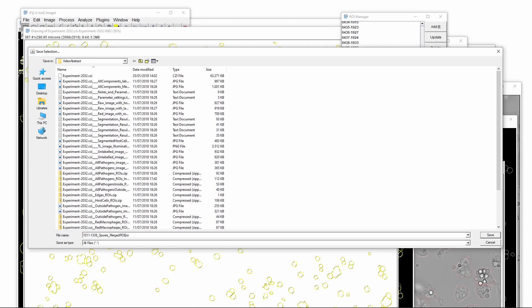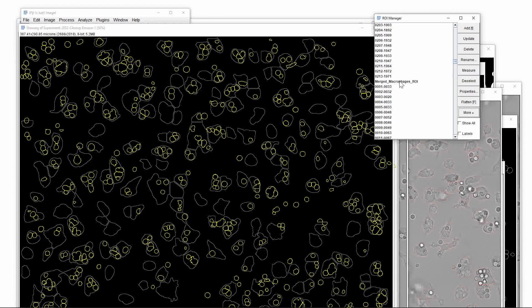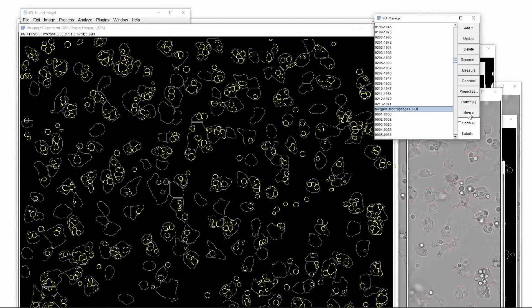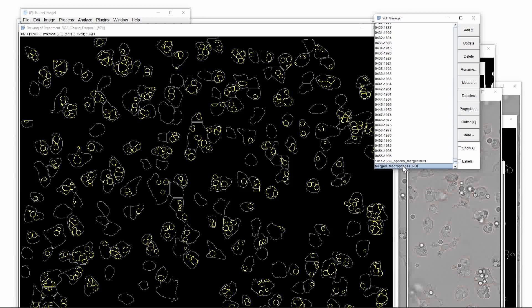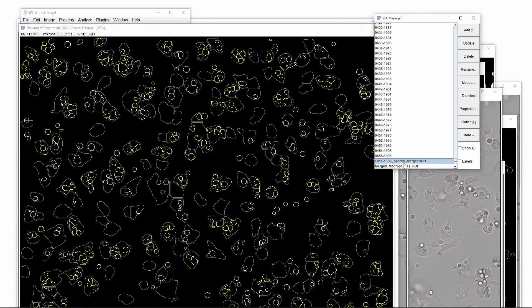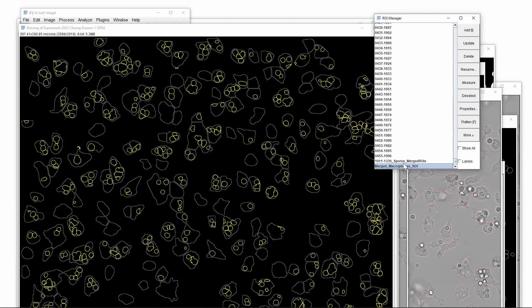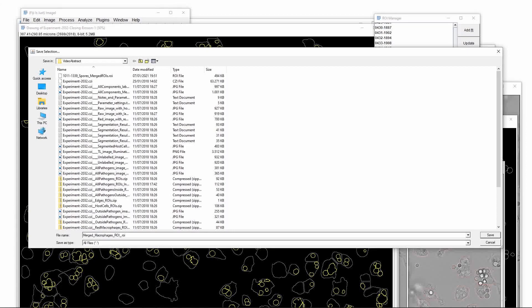In order to see the inside spores we will select the two merged regions, one for the macrophages and one for the spores, and on these two files we will now run the AND command. This will select those spores which are inside the macrophages. Switching between the two sets back and forth we will clearly visualize which spores are inside and which spores are outside the macrophages. This is the final result of our demo analysis so let's save them to the hard drive.